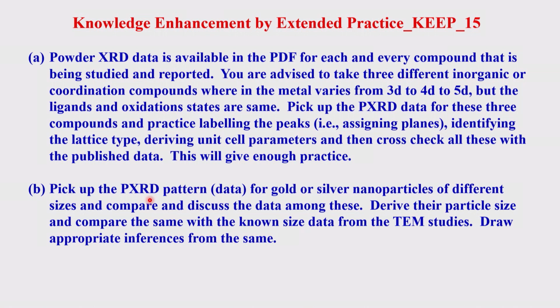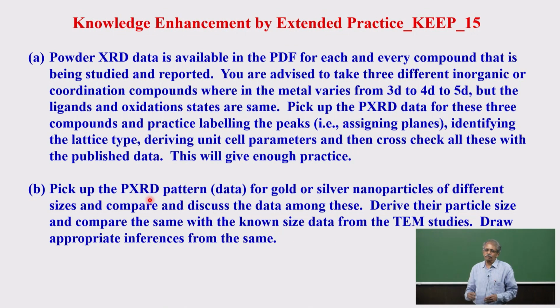For example, coordination complexes. A large number of crystal structures are known. Powder XRD data is known. No problem. Absolutely. What I have brought to your notice here is some information which, if you use it, you can take a selective one and then focus on that. For example, powder XRD data is available in the PDF for each and every compound that is studied and reported.